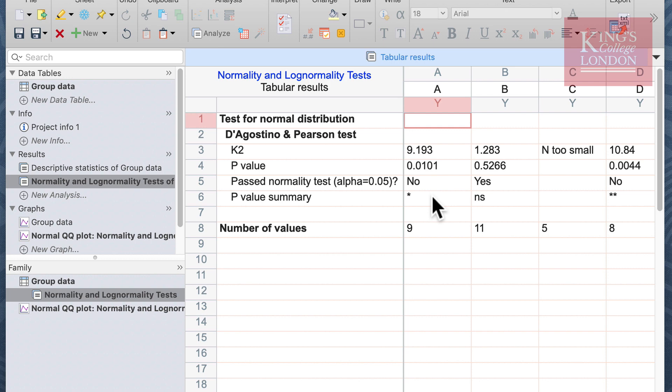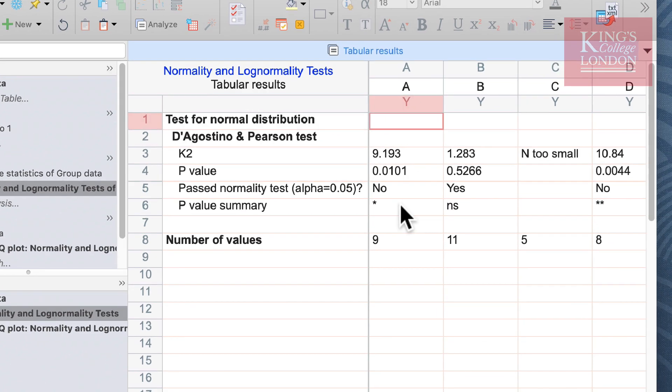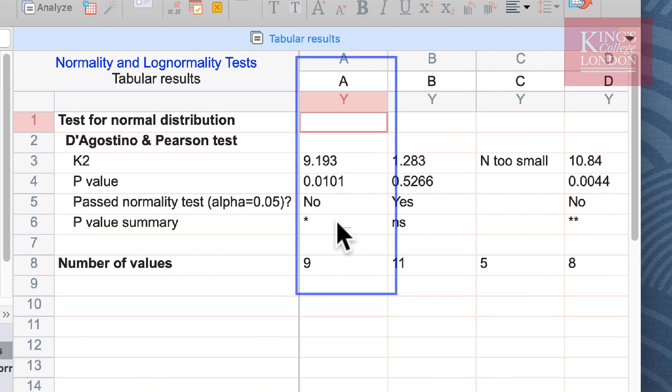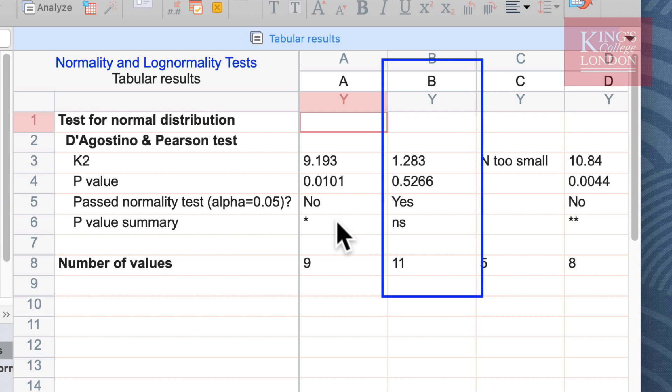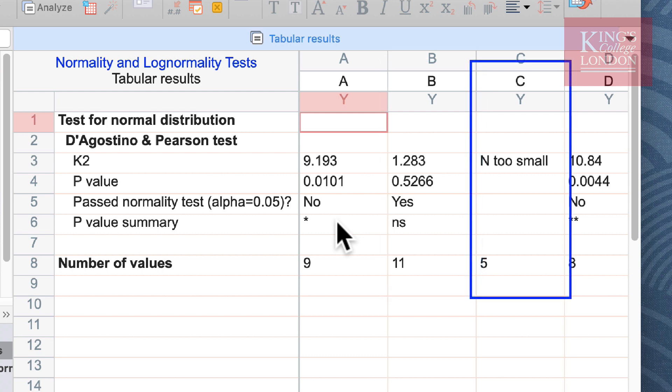It's interesting to see here that group A has failed the normality test. You can see that group B has passed a normality test. Group C, the data set is too small. We only have an n of 5 here and this was not able to do a full normality test on it.